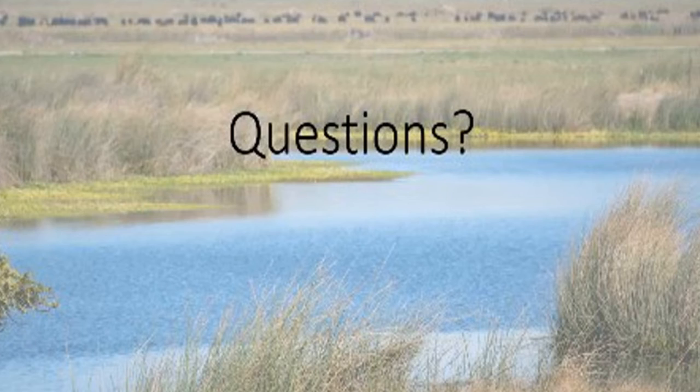Sarah can weigh in on what they do for their Smith-Root samples, and it will often depend on how you're collecting your sample. There are some options for filters that are desiccating, and then you can collect it, it dries out by itself, and it's pretty shelf stable for a period of time. Otherwise, we use some preservation solutions to extend the shelf life of our samples before we can get them into the freezer, where they can live at -80 basically for eternity, more or less. But Sarah, take it away.